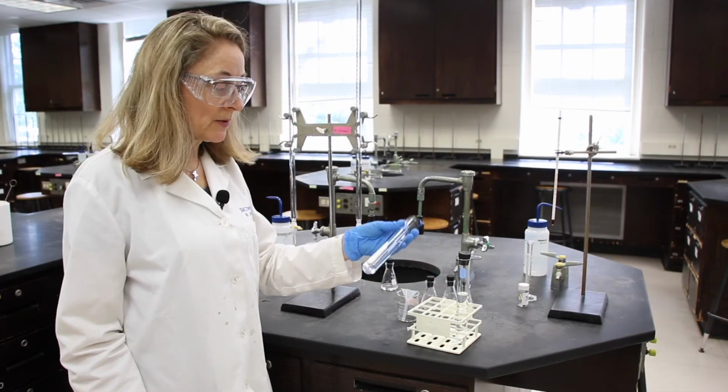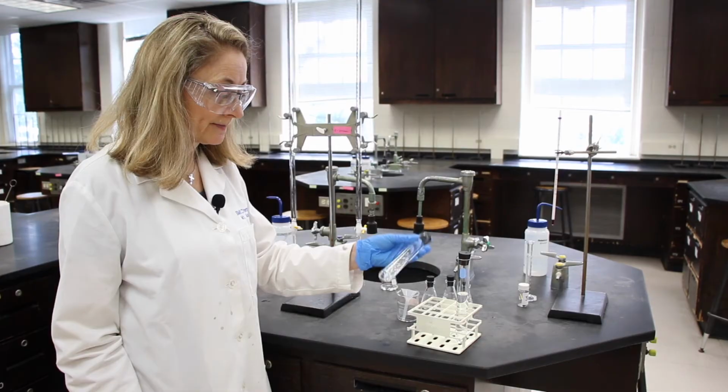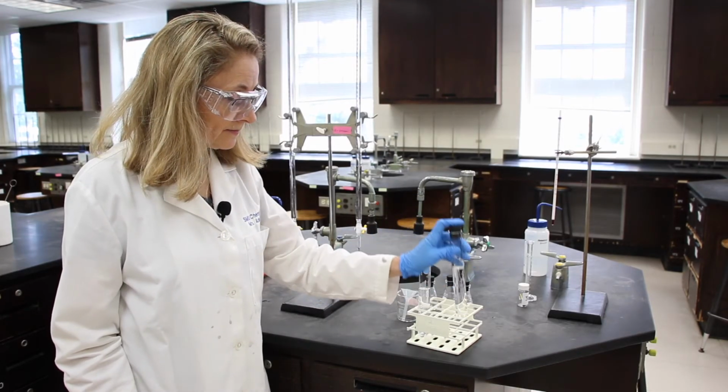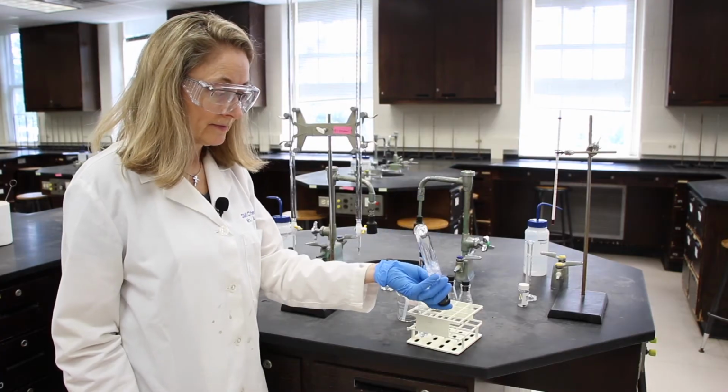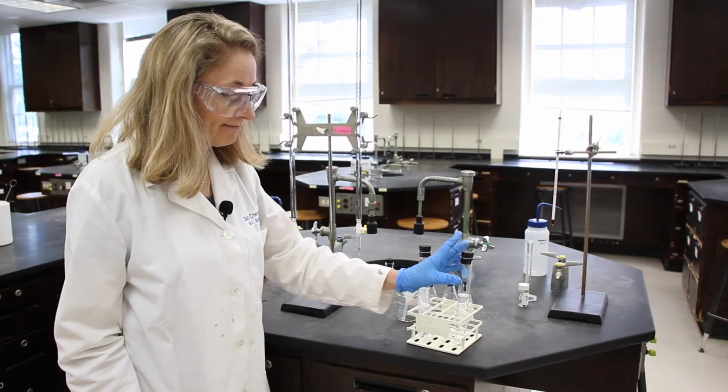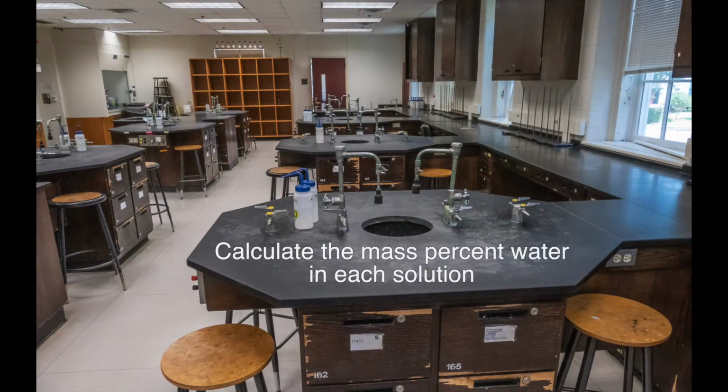Next, I'll mix both of the solutions. You'll need to calculate the mass percent water in each of the solutions. First, calculate the volume of DI water and 2-propanol in each test tube from the burette readings. This value should go in the 3rd row of each table.